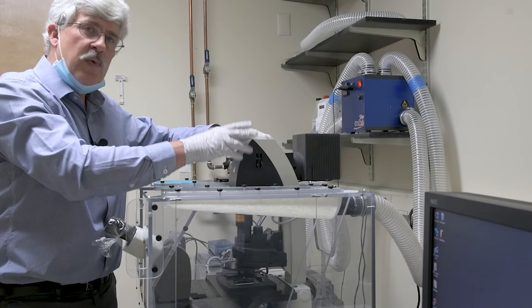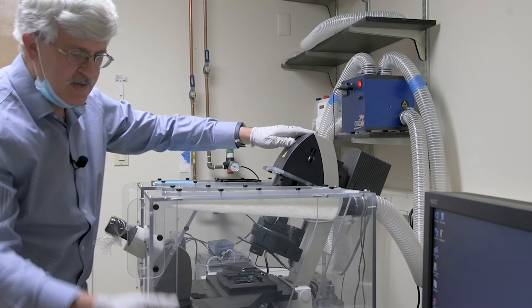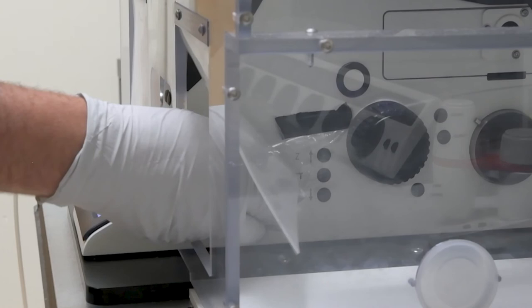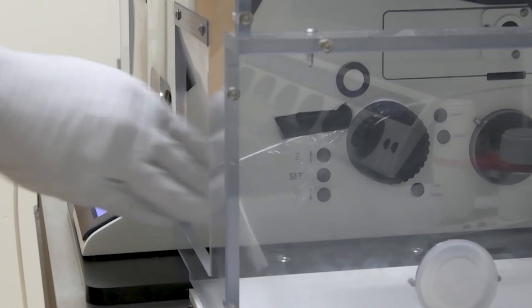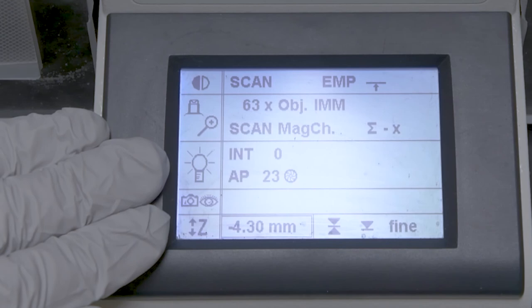First, this is what I call the condenser stock, the condenser's on here. You want to make sure it's not sticking down into the pathway, so just take it and tilt it backwards. Make sure to hold on to it so it doesn't fall back. Next there's some buttons down here. We want to make sure there are no objectives sticking up through the stage like that one that got scratched. So we need to make sure the objectives are all lowered as far as they can away from the stage. Look for these three buttons on the side of the microscope and this is how we'll do it. If you push and hold the very bottom button it will retract the lens all the way to the bottom. You can confirm this by looking on the front panel and it's going to tell you the z position. It tells you minus 4.30 millimeters and that's about as low as it's going to get.